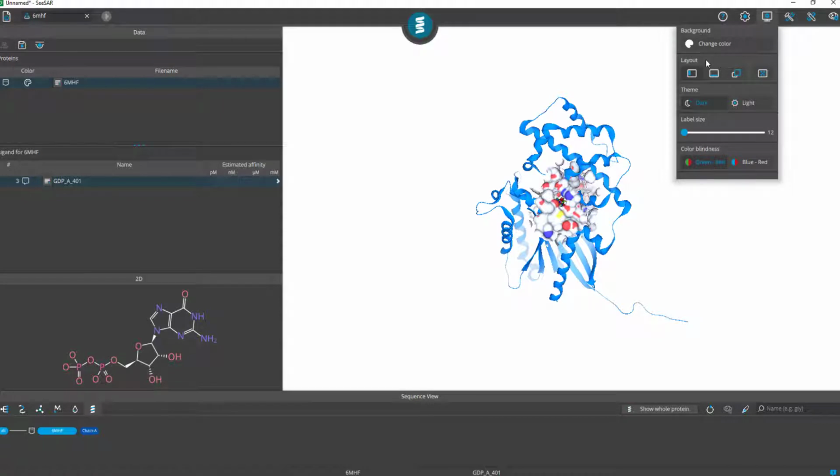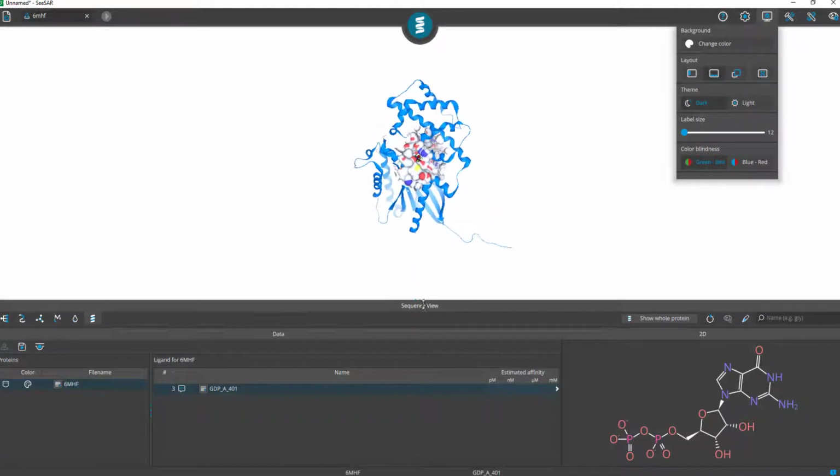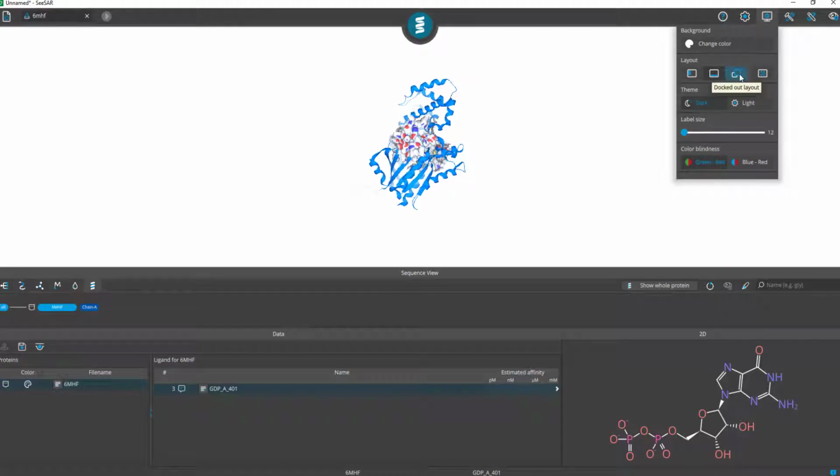Next we have a bunch of layout settings. What we use now is the most common layout, called the left layout. Another version called the bottom layout is available, where the 3D display has the top position of the screen and all the other tables are at the bottom of the screen. If you have a multi-monitor setup, it's often useful to keep different parts of your entire screen separated, in the sense that one could have just the 3D window on one monitor, and all of the others on the second monitor.